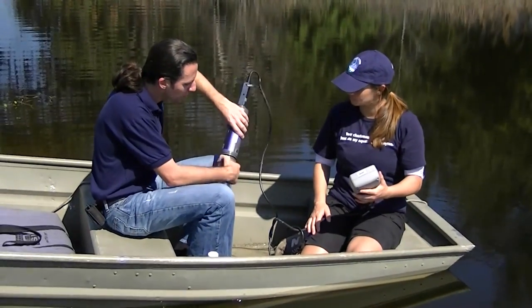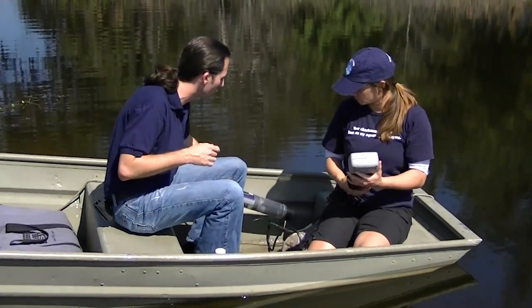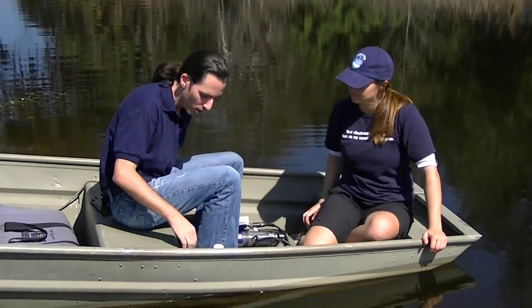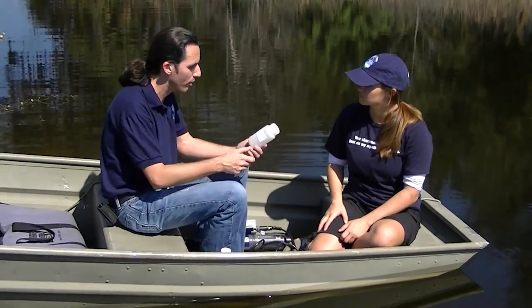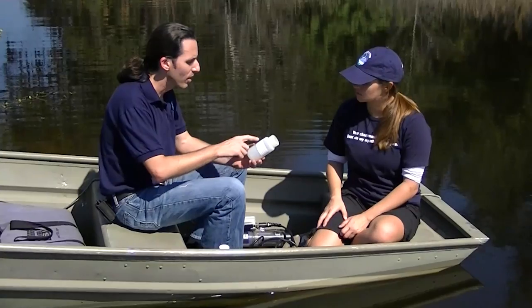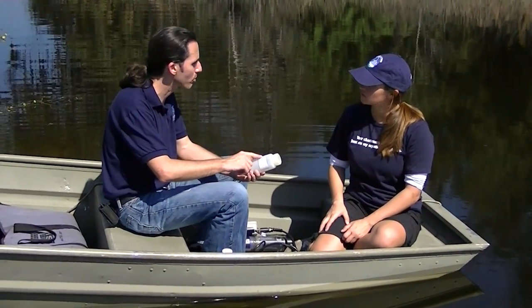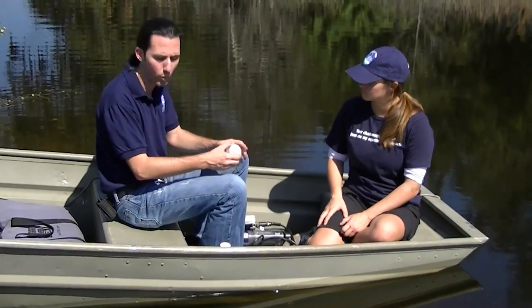We also take some grab samples just like what you do through Lake Watch, and they're analyzed in a lab. One of the main things that you do through any of our volunteer sampling programs is take a bottle like this. It has a label where you list the water body and some other information that will correspond to your data sheet. So you always want to make sure you fill both of those out so we can track what goes where.